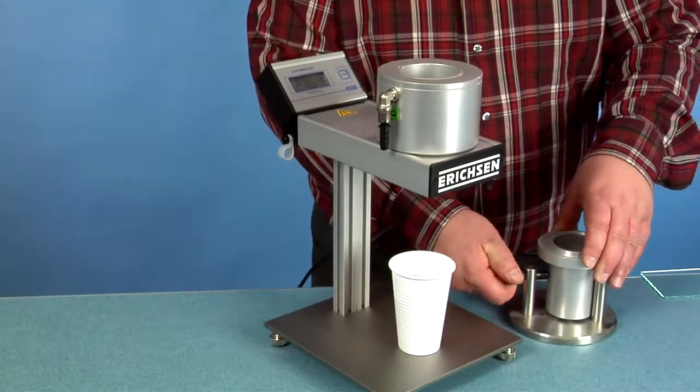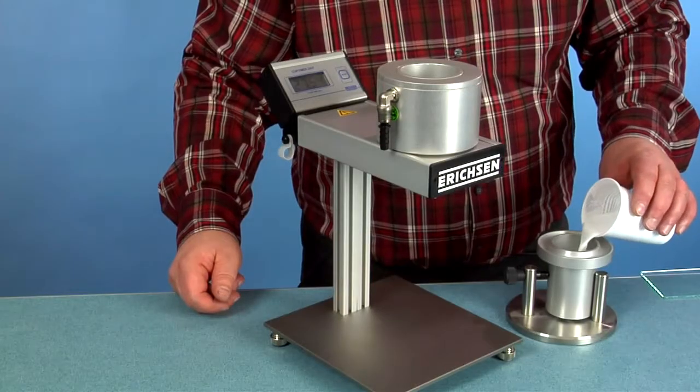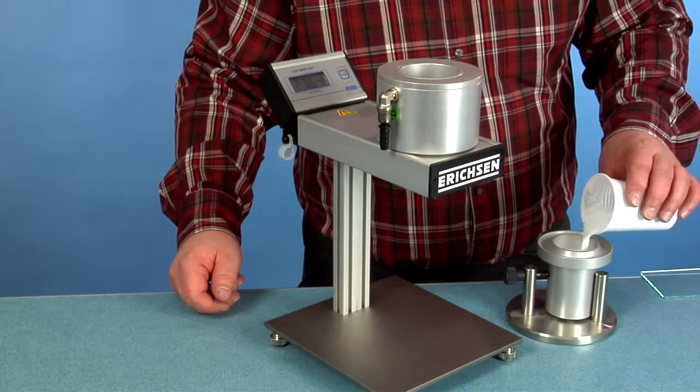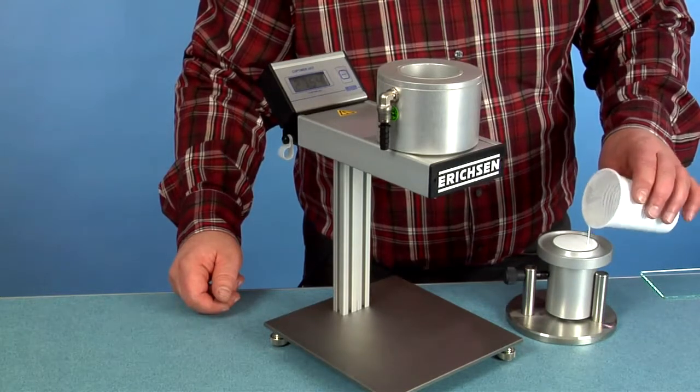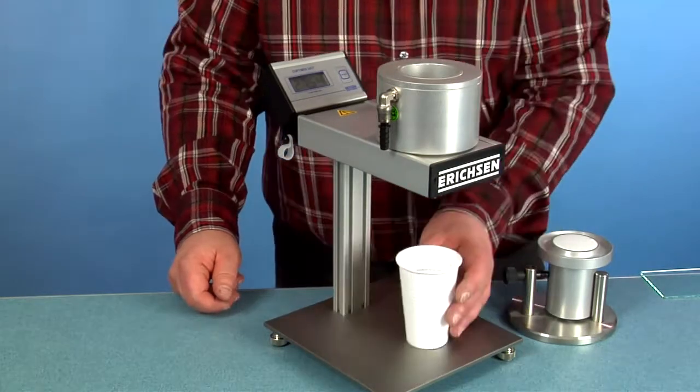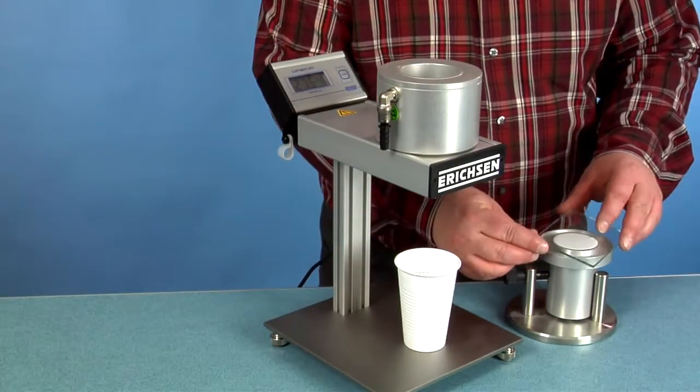Fixing the flow cup into the filling support stand. Filling with liquid coating material to be measured. Densely covered with a glass plate.